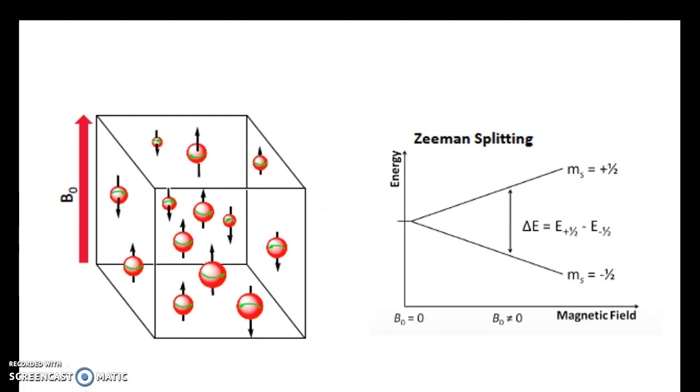In the macroscopic world, the two magnets can be aligned in an infinite number of orientations. At the atomic level, these alignments are quantized, and the number of orientations, or spin states, is equal to 2I plus 1. We will only deal with spin 1/2 in 2 states. So once we add the magnetic field, everything lines up, either up or down when we look at the arrow, so one of the 2 states.